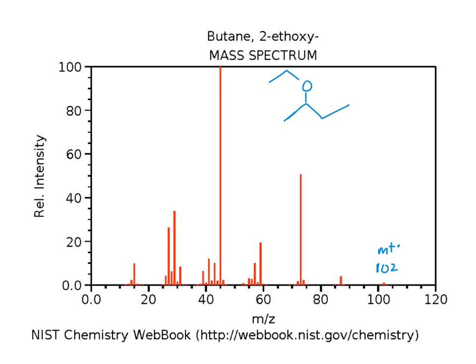Okay, so we're going to end up with a radical cation on the oxygen. And then we can do either radical-initiated cleavage or cation-initiated cleavage mechanisms. Right? They're all going to be competing with one another. So, for example, we could do the alpha cleavage ones, the radical, like this, remember?